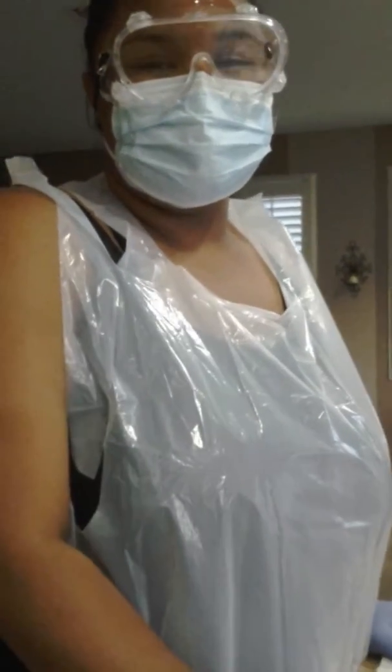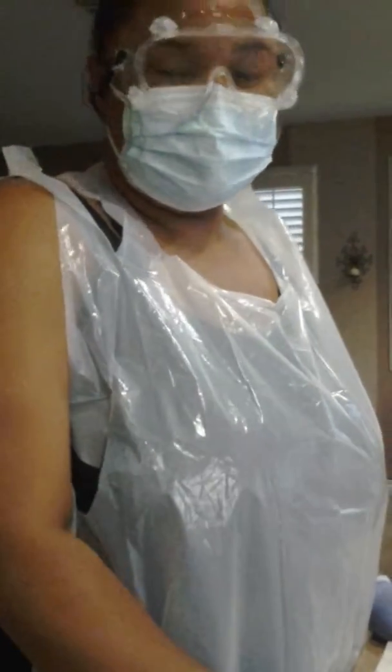Hi, my name is Joanna Seeley, and today I'll be doing a presentation on the sheep brain. And this is the sheep brain.